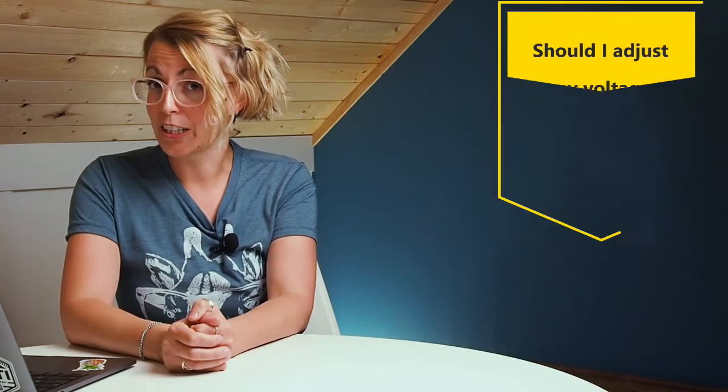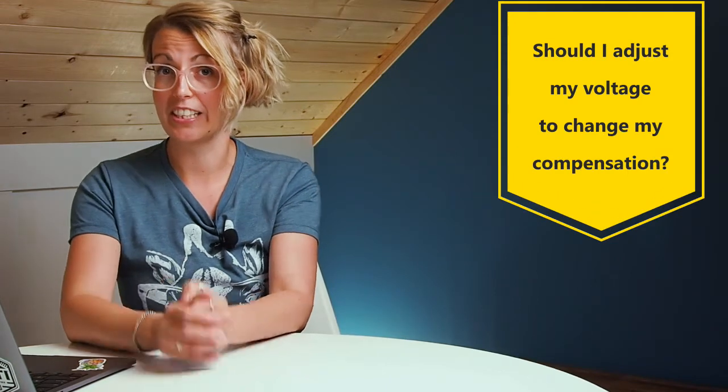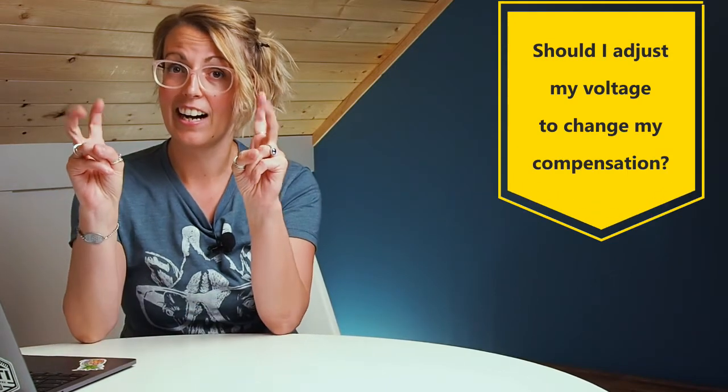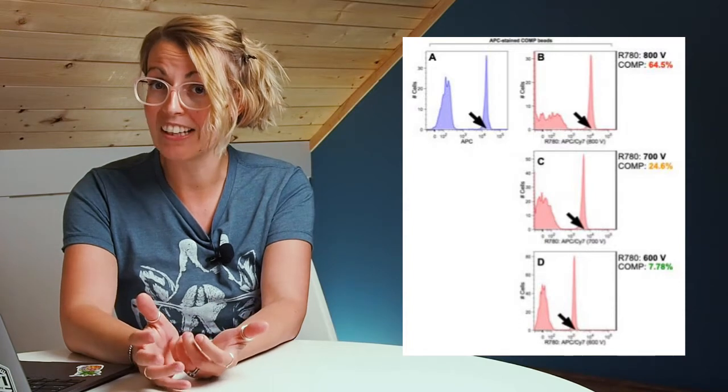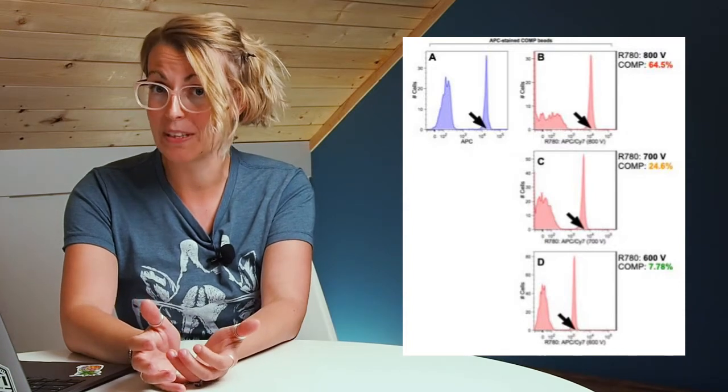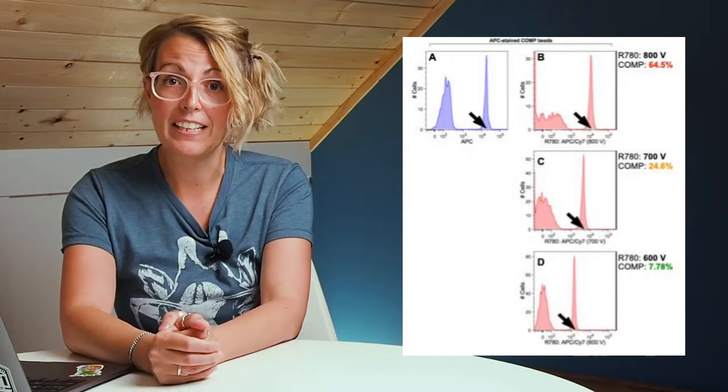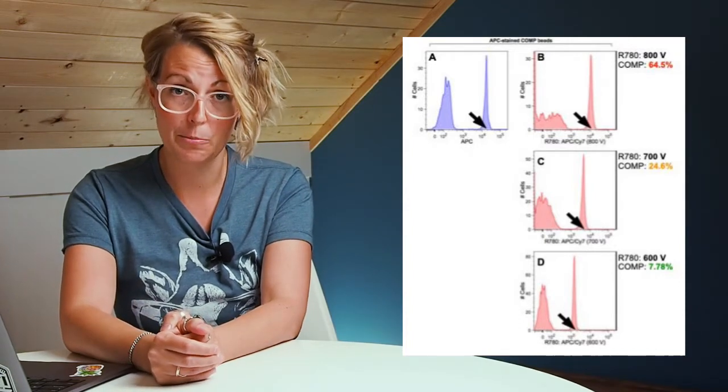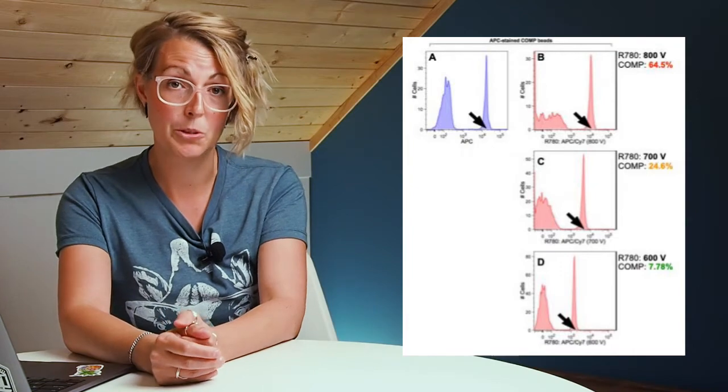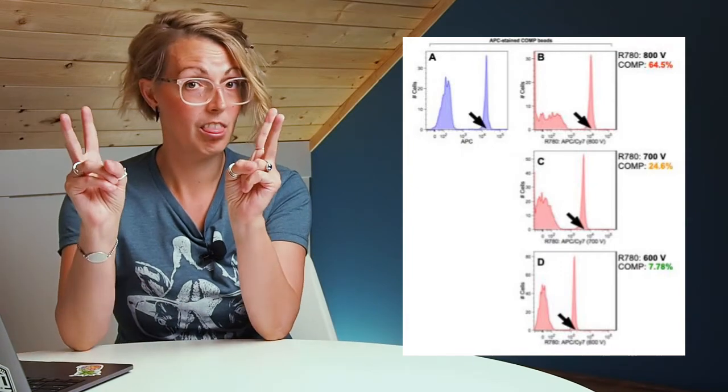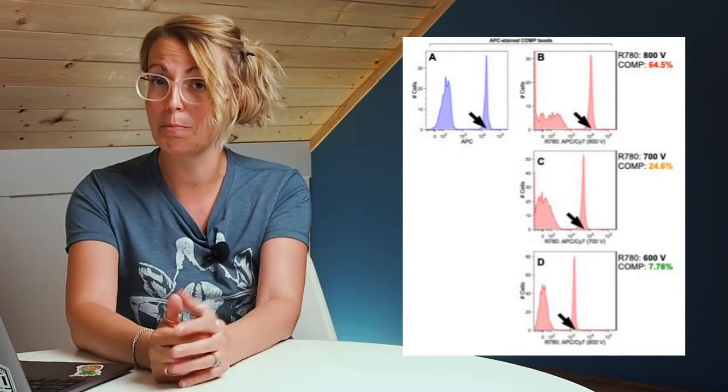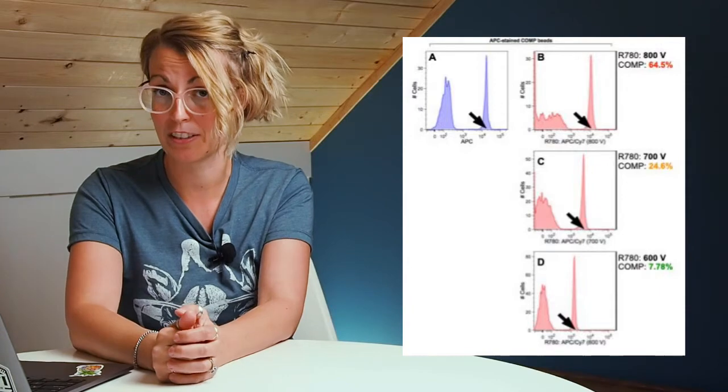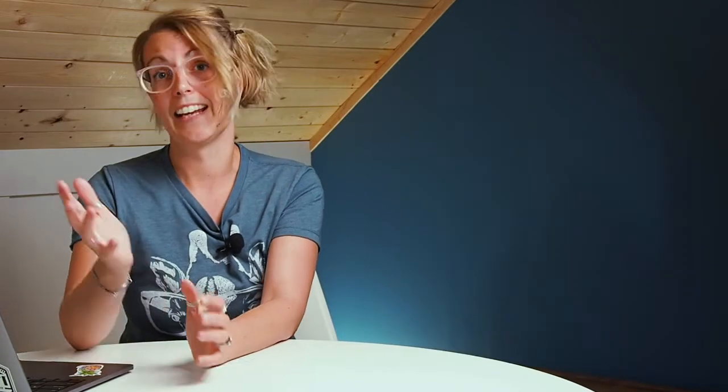The second question I'm often asked is, should I adjust my voltage if my compensation is high? First, it's important to note that adjusting your voltage will change your compensation values. As you lower the voltage, you will generally have a lower compensation. While this may seem beneficial because people seem to like low compensation values, it may not actually be best for your experiment. This is why we always recommend running your compensation samples and your experimental samples at the same voltage, because compensation will not be valid at different voltages.